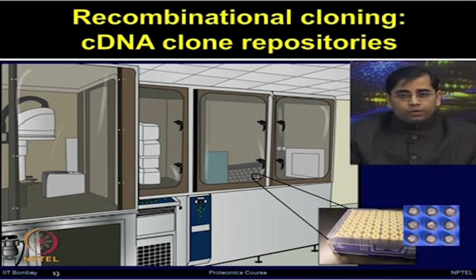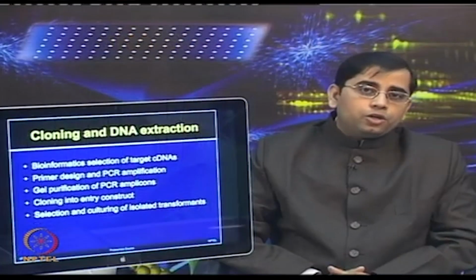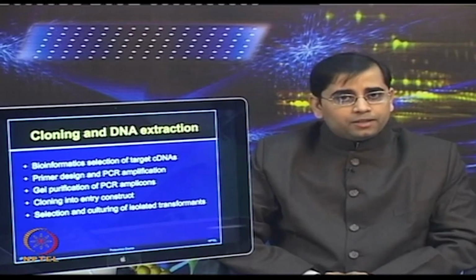So, these clones are sequence verified, they are usually in Gateway or Creator vectors, which can be transferred to the suitable vectors very easily.